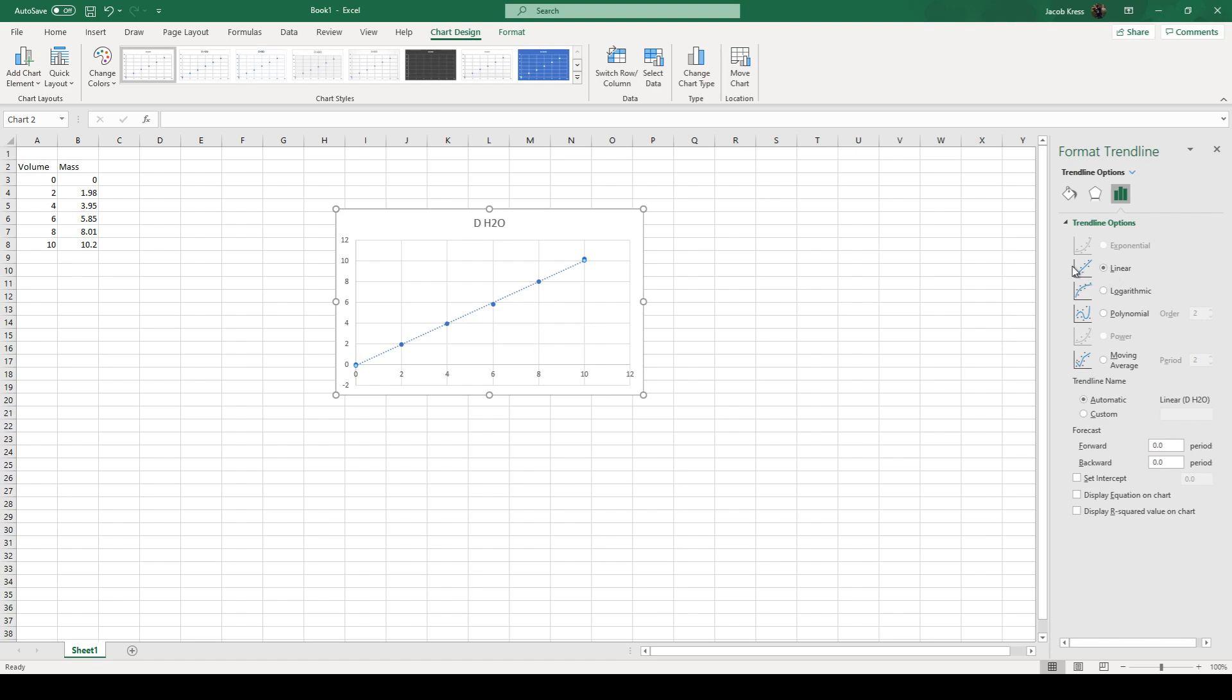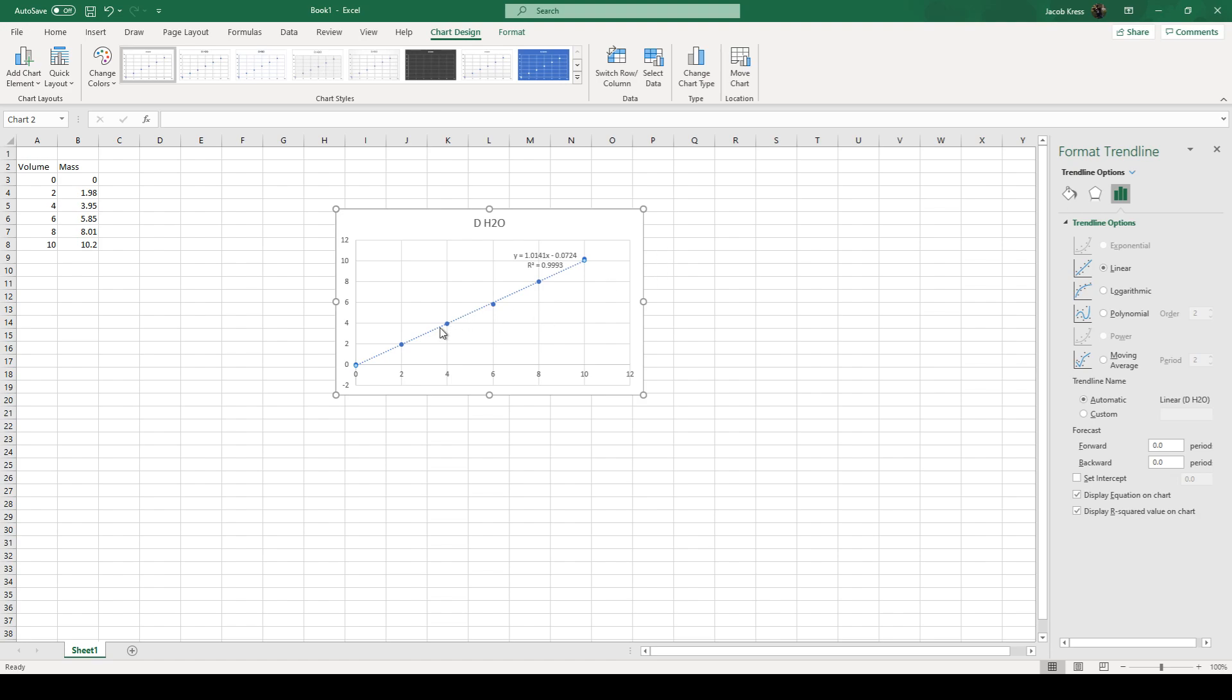We want to make sure it's linear because this is a linear series. We want our equation of the line that it gives us to give us a slope that rise over run. So we're going to go display equation on chart. And a good habit to get into is to display r squared value on chart.